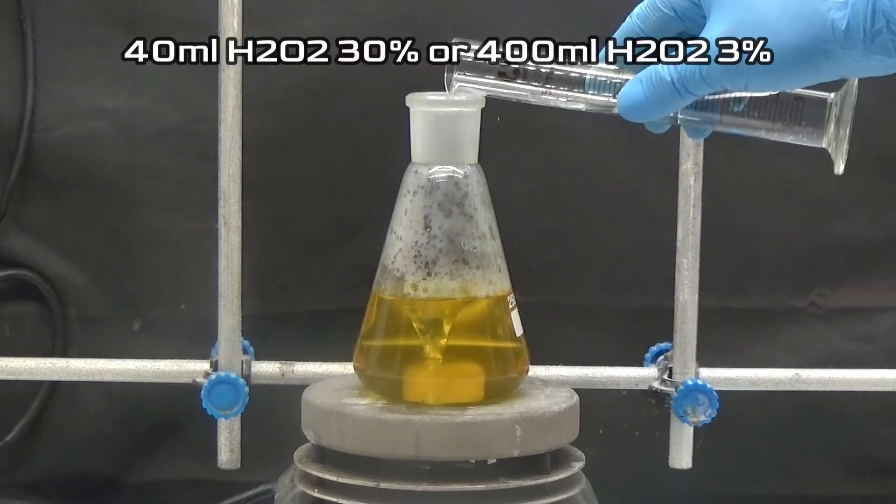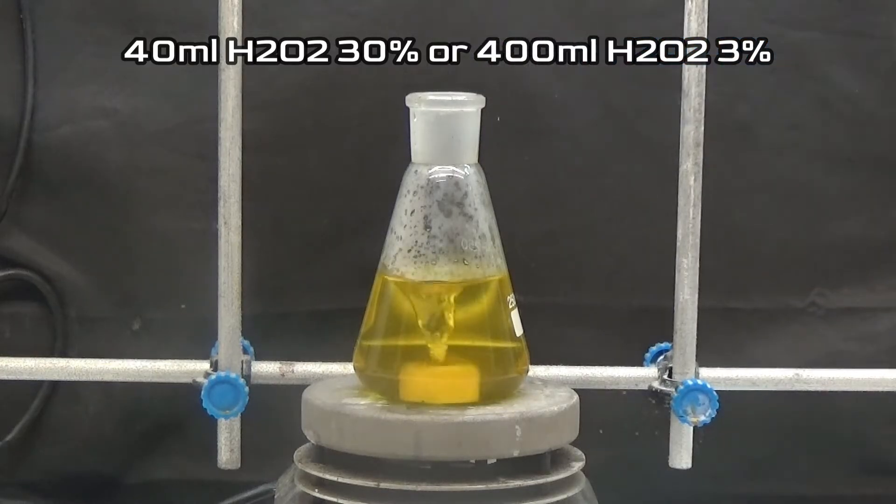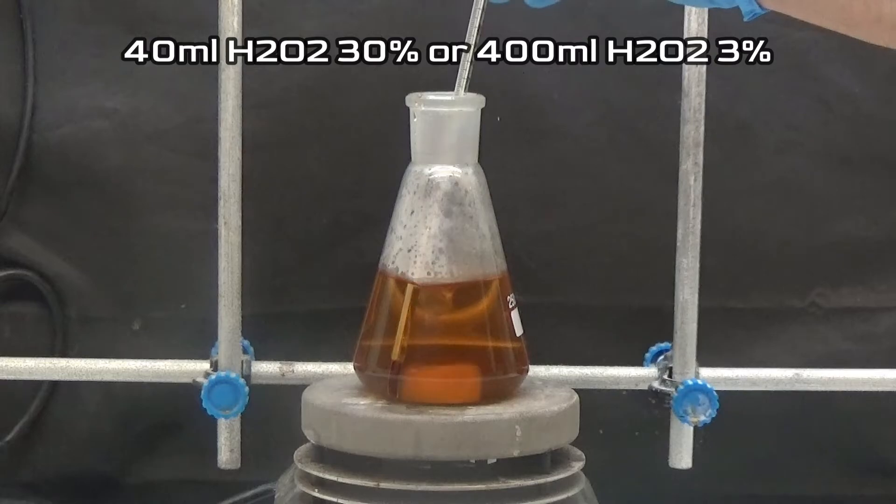When the solution is homogeneous, add 40 milliliters of 30% hydrogen peroxide. If 30% hydrogen peroxide is not available, use 400 milliliters of 3% peroxide and change the 250 milliliters flask to a liter one.